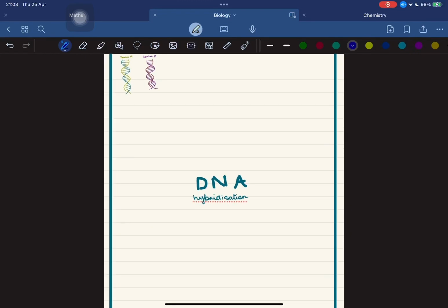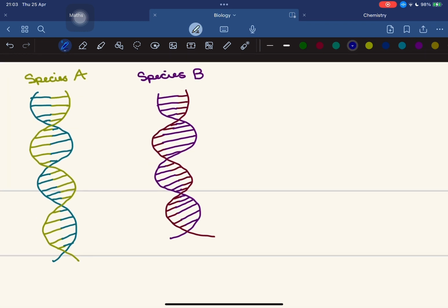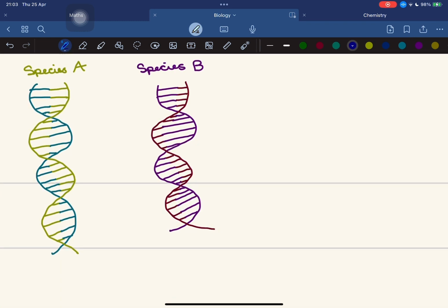Hi guys, so today we're going to be going over the DNA hybridisation process for the OCR A level spec. In this example, we're going to be using the DNA from 2 species, but you could also use it with 3 species. So the first thing we're going to do is begin by extracting these DNA samples from each of the animals.